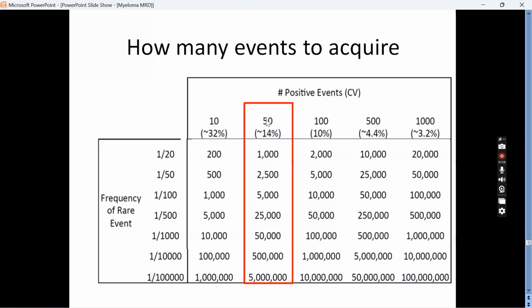That is, when I'm doing a myeloma analysis, when there is a kappa restricted abnormal myeloma population, which are 50 in number, that is my minimal criteria to call it disease. For example, let me explain like this.